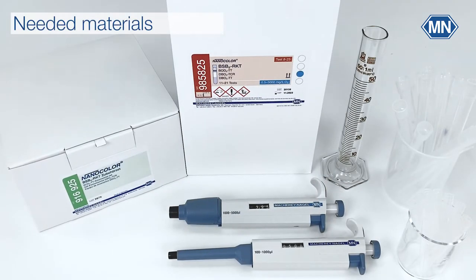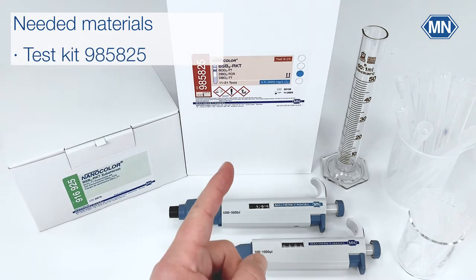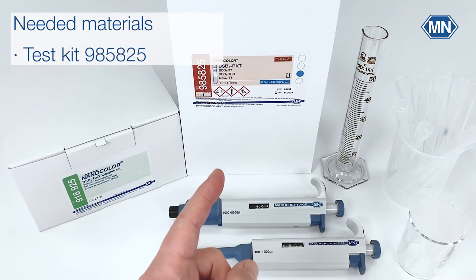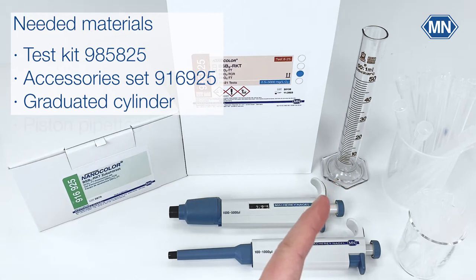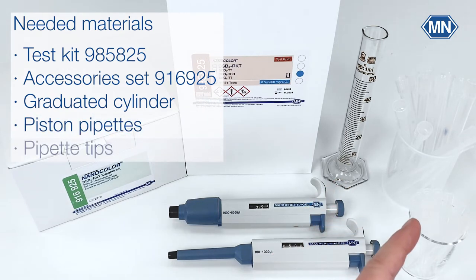To perform the BOD5 tube test you need the test kit itself which is sufficient for 22 determinations, the BOD5 TT accessory set, graduated cylinder and piston pipettes with pipette tips.